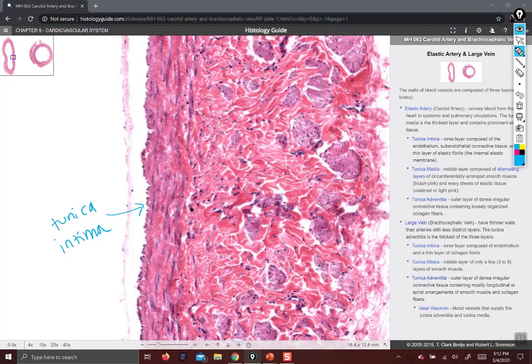Here we have squamous endothelium without much underneath, then a very short tunica media. Also note this has smooth muscle fibers only — no elastic fibers. And then the tunica adventitia, also called the tunica externa, is this layer: dense irregular connective tissue. So same layers as the artery, but different constituents and different thicknesses. That's the key.